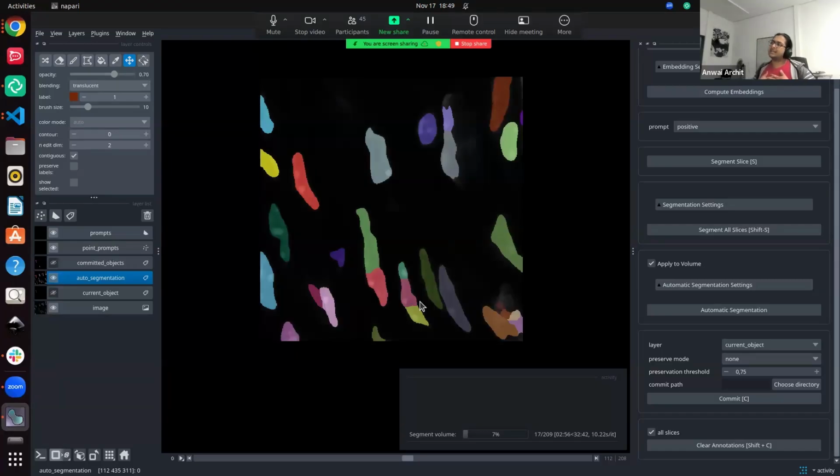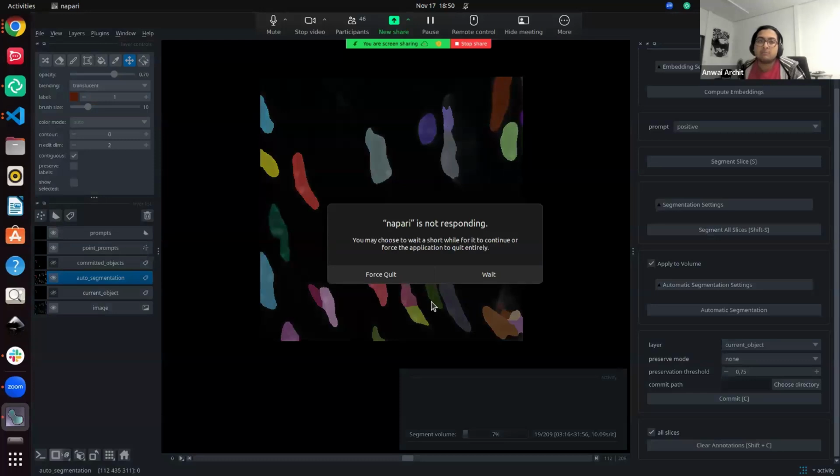But there was a huge range, though not a massive range of data, because from our knowledge, PlantSeg is the biggest plant cell cohort we are familiar with. If you're familiar with any of these plant cells, I would be very happy to have annotated data. But the plant cell images look like fluorescent images, not bright field. Yes, that one you're right about. They look more on the fluorescent side because one of them is light sheet. Another is confocal. I forgot the staining or any details about the root cells.